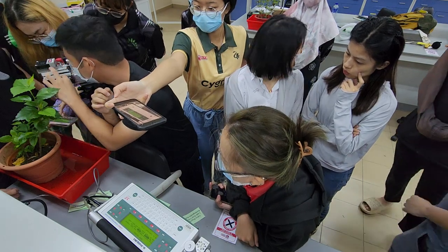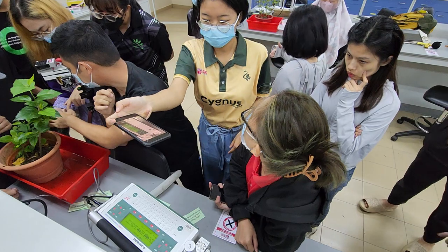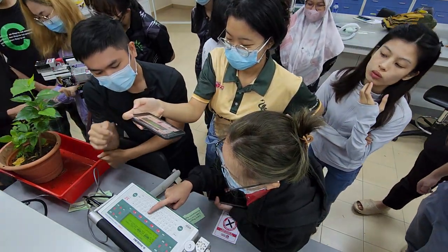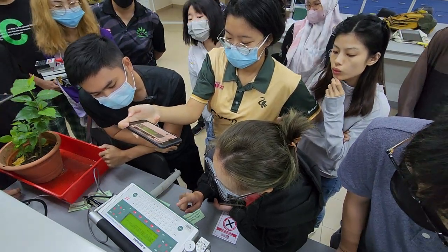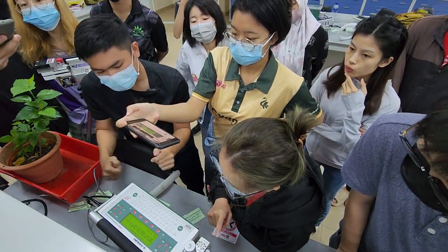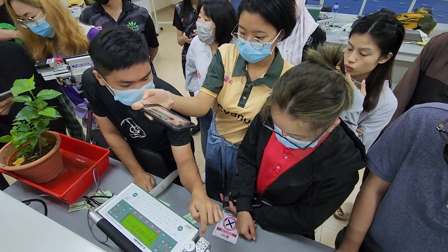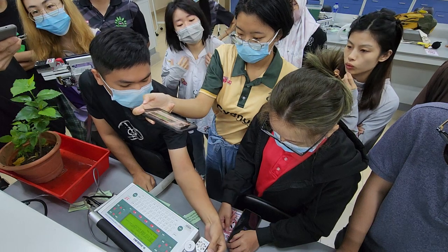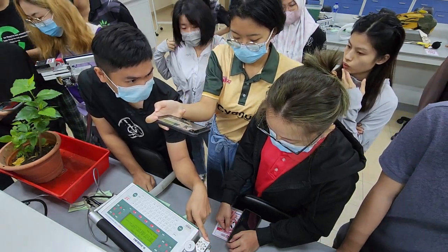你先看那个 measurement, 你 measure 它有没有换. Then 你去 F3 这个. Okay. So the chamber must be close to zero. Okay, so first to zero you need to scrub the chemical column. You can see the arrow here, right? So you turn left is scrub, you turn right is bypass.